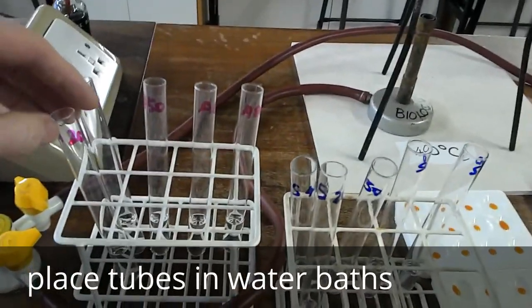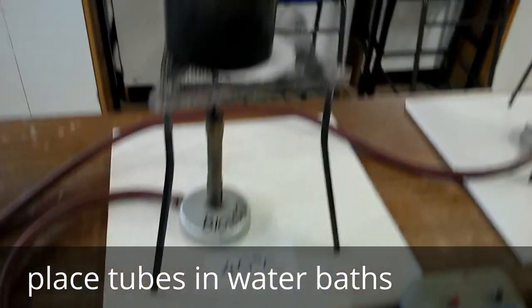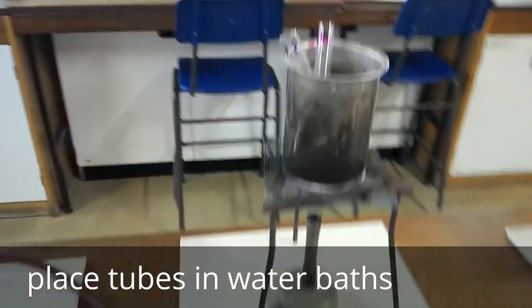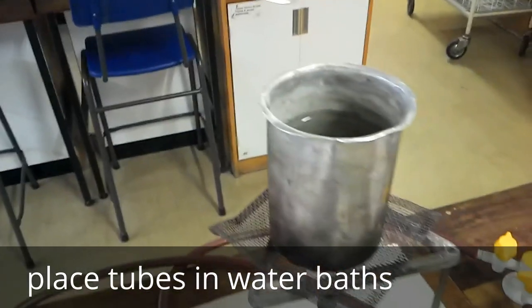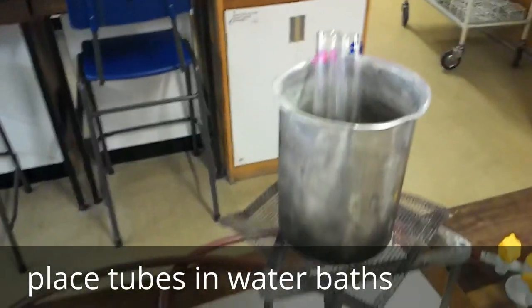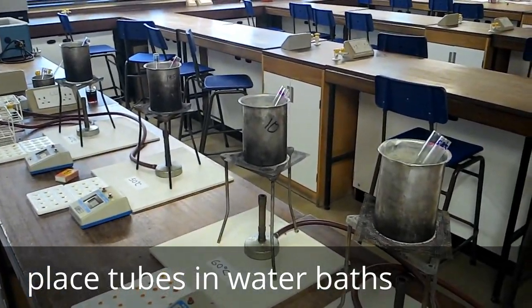Next, you need to take your tubes, so your amylase for 20 degrees, your starch for 20 degrees, your amylase for 40 degrees, put them in, your starch for 40 degrees, etc. So pop these into your cans that you've already prepared for temperatures. Put them in. So we've now got our substrate and our enzyme warming up, ready. Leave them in their cans for 5 minutes to equilibrate.